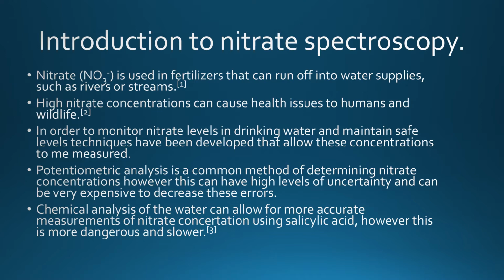So one of the biggest uses of nitrate is in fertilizers. So this will be in the form of potassium nitrate, most likely, and the issue arises when you have fertilizer runoff into local streams and rivers.